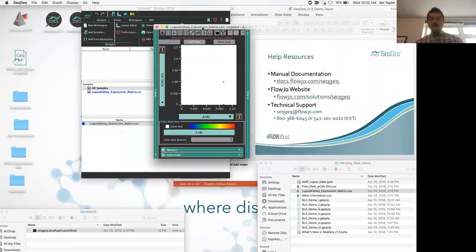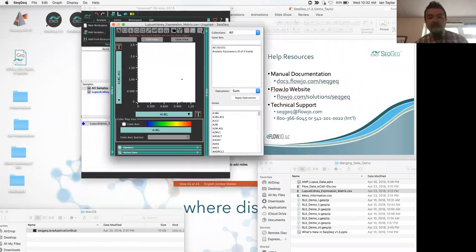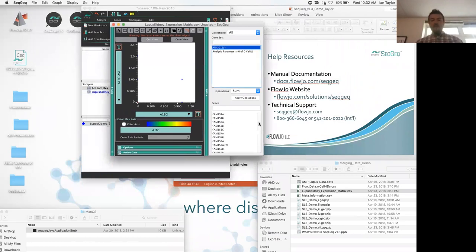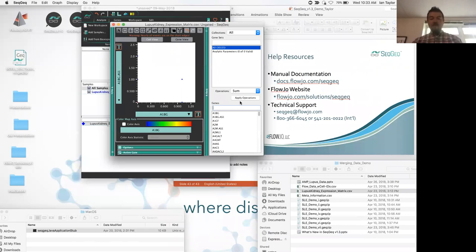Once loaded, I'll double click to open the graph window. Within it we can see genes listed — and if I open the X parameter selector, we can see there are 30,000 different parameters in this data set. But we haven't gotten any flow data in there yet — I can prove that by typing in '-flow' to search all 30,000 genes, and we don't see anything.